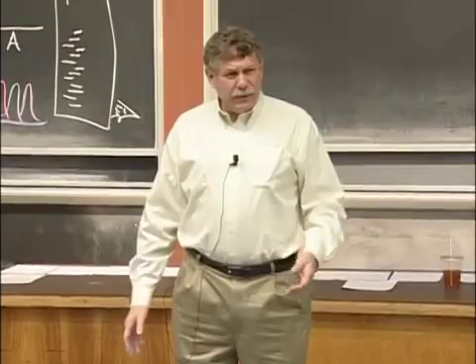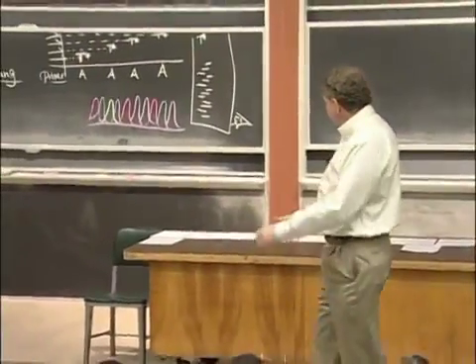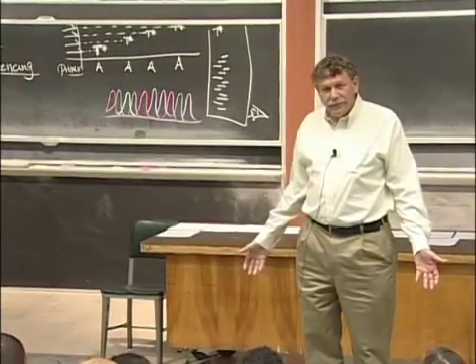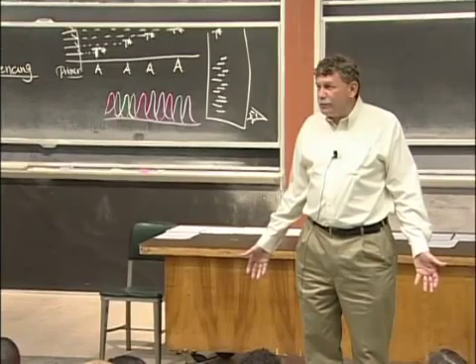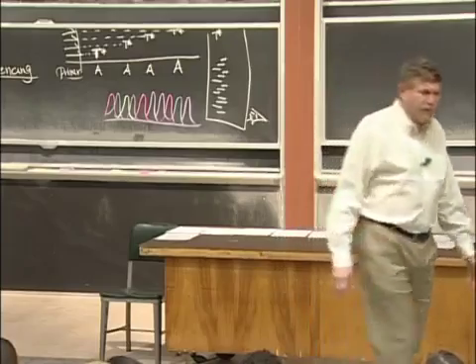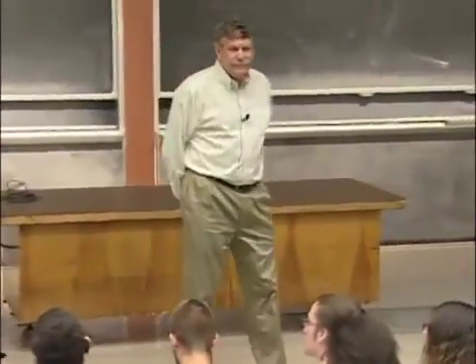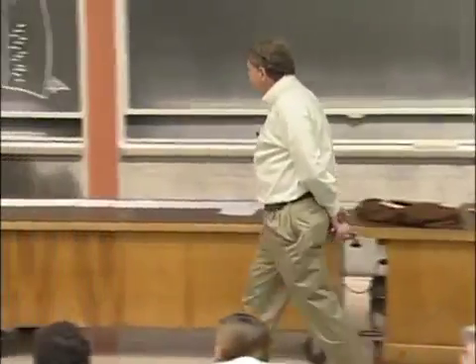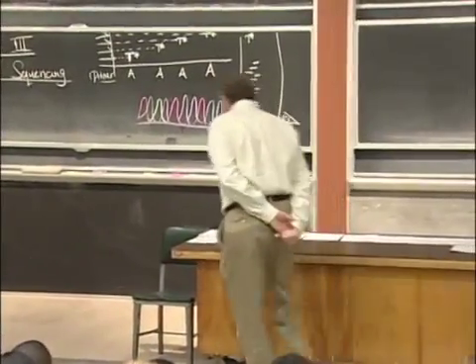But how do we know what sequence we're supposed to use? Here's my clone. It's, say, the arginine ARG1 gene. How did I know what sequence to start with? You let me get away with just putting a primer there, and what does it match? I did use EcoR1.